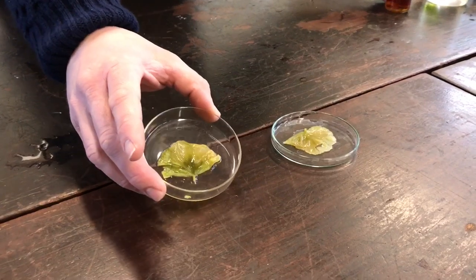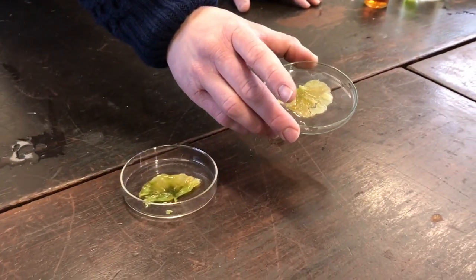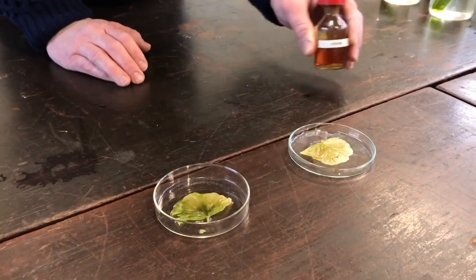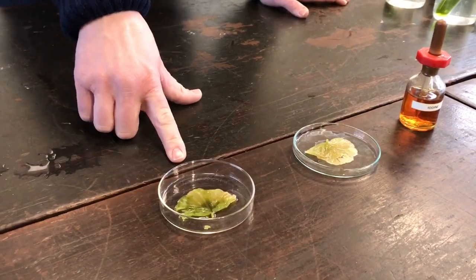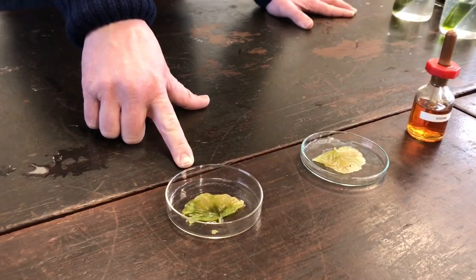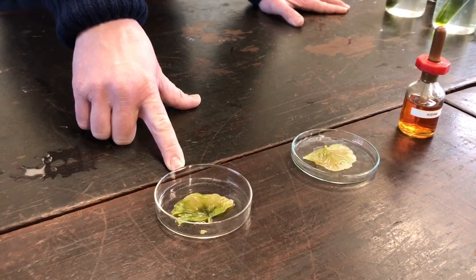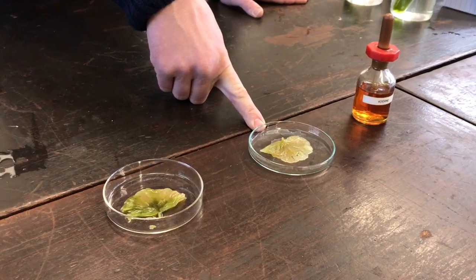This leaf here is darkening — it's going blacker. This leaf here is staying light and quite brown, which is the normal colour of iodine. That would indicate that this leaf has been in the daylight, photosynthesis has occurred, and starch is stored in the leaf. And that would indicate here that no starch has been produced and that this leaf has been in the dark.